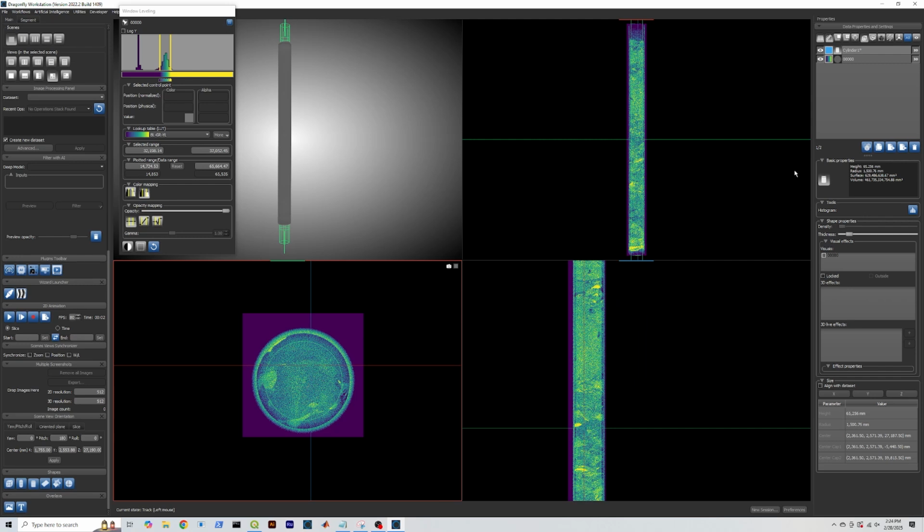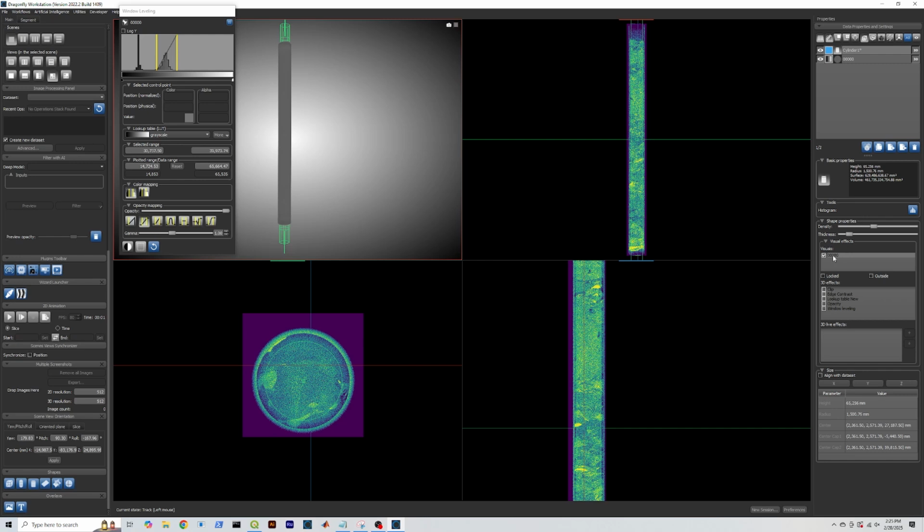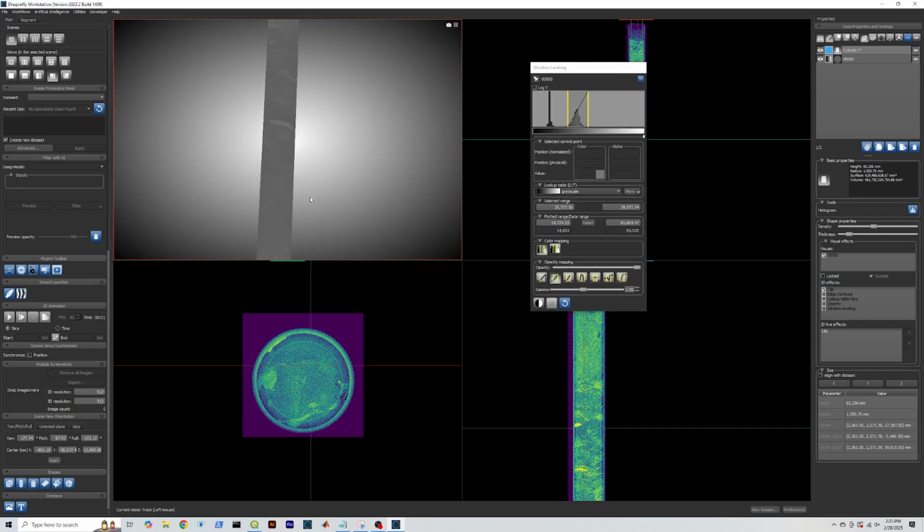Okay, so now what do we do? Now we're going to go here to our three-dimensional view, and we are going to select the cylinder, and we're going to clip our core imagery to our cylinder, and we're going to clip out the outside. We're only going to leave what's left on the inside. And these are the five options that you have here. So we're going to use the clip function, and now as we update this, oh look, we have lost our air. All we see now is the core barrel itself.